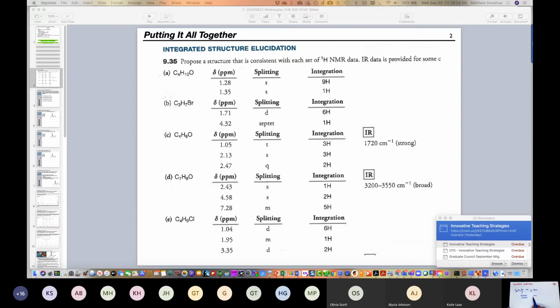So once you do that, then you realize the halogen can only have one bond. You can immediately propose the following. You can stick the bromine at the methyl position or the methylene position. So there are 2 possible constitutional isomers you could propose. Just looking at these, which one matches the data best, A or B?